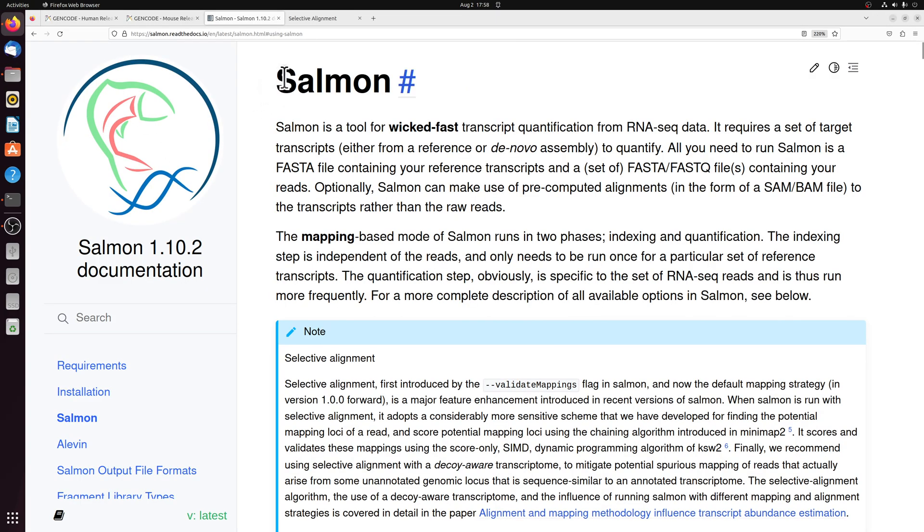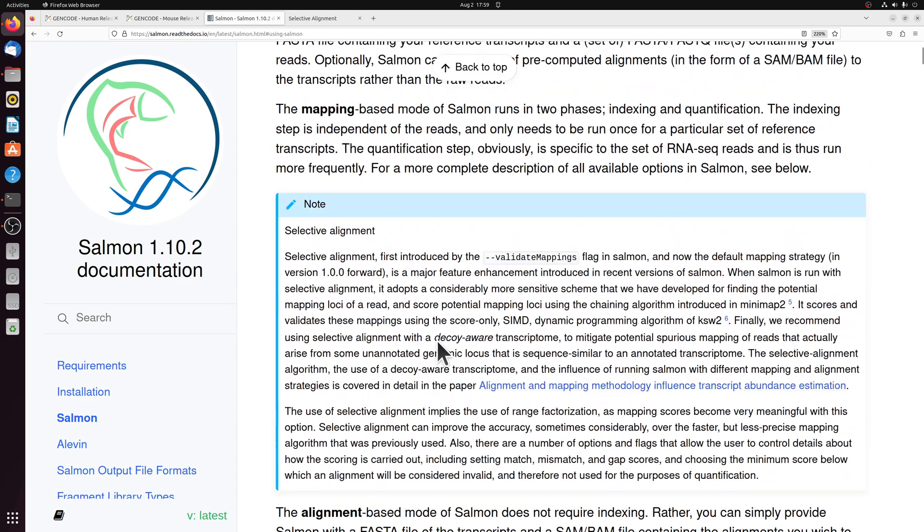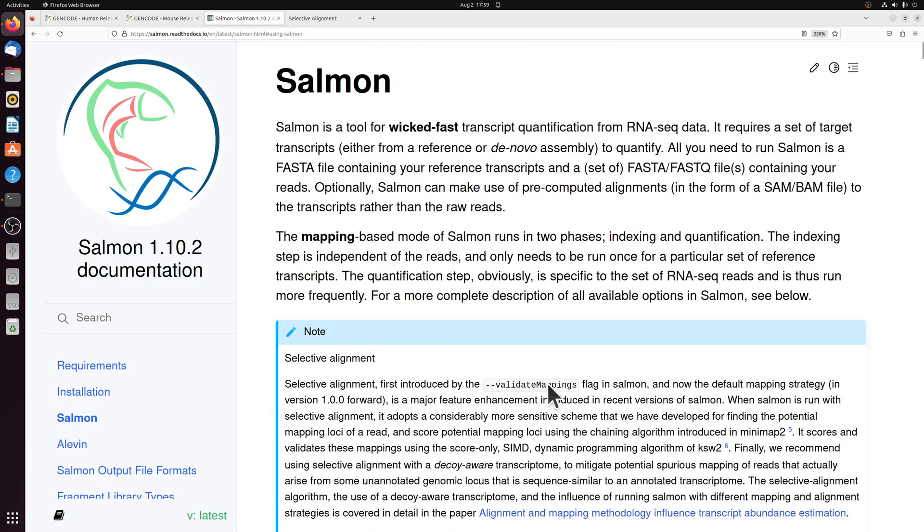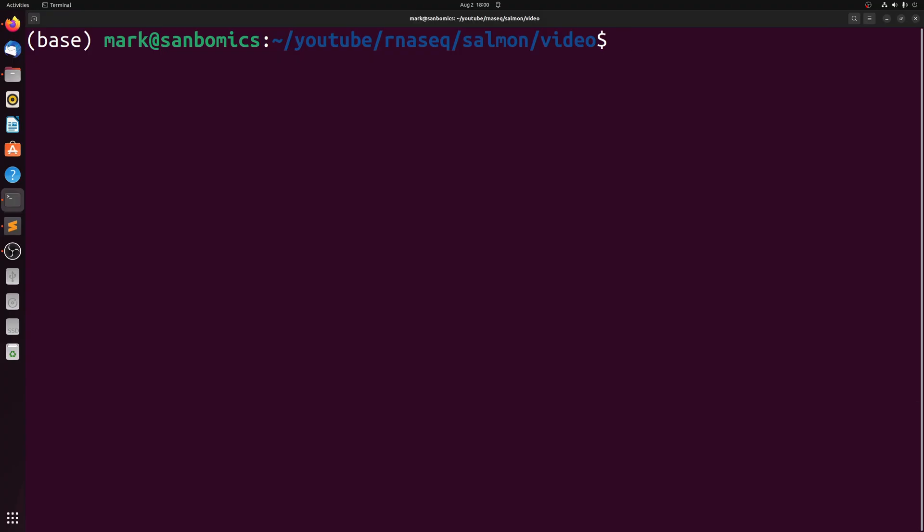But before I begin, I should point out that salmon has some pretty thorough documentation. I really recommend giving this a thorough reading before you actually do your alignment.